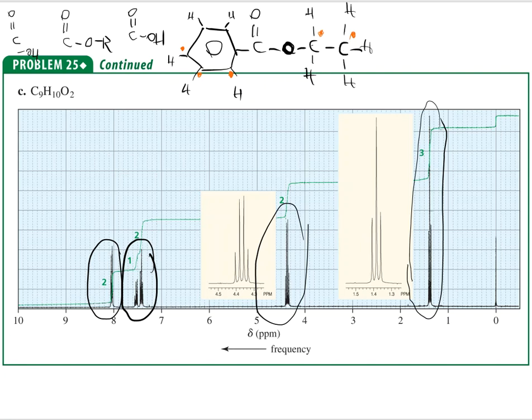So it looks like there's a total of 5 signals based on what I've drawn here. All right, well, that's pretty good, right? I mean, here we get 1 signal and 2 signal and possibly 3 and 4 signal right there. And then here's this last one, which is 5 signals. So the number of chemical shifts kind of match at this point.